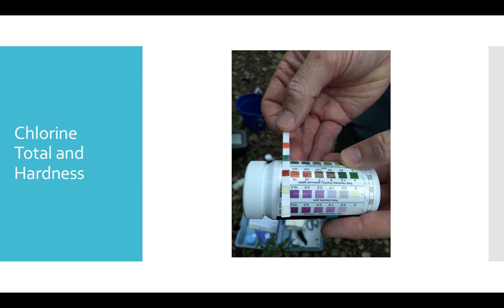All right. When we look at chlorine and hardness, we're looking at these two rows right here on the end. They show 0 total chlorine and 0 free chlorine. That's good. When we look at hardness, we notice that the calcium carbonate is pretty high, 25 grains per gallon, or 425 parts per million. That's actually pretty high. But this is a result of what the stream banks were.